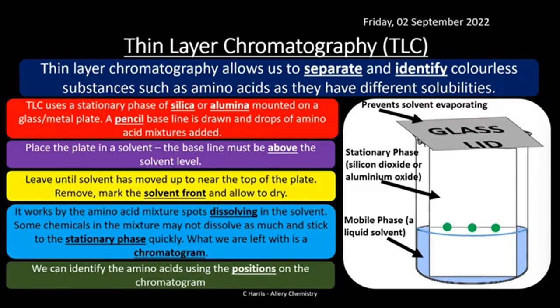So what we do is we place the plate in the solvent. Remember, the baseline must be above the solvent line, so this line here has got to be above the actual line of the liquid. In the experiments, we can identify amino acids by measuring the positions in the chromatogram.